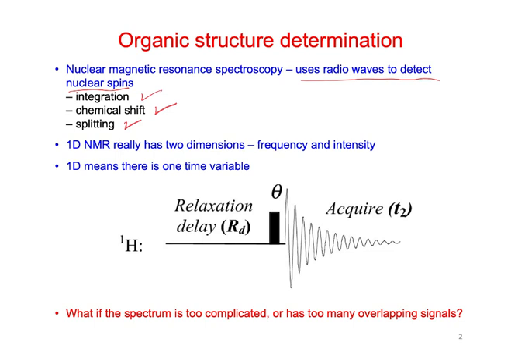So why do we need more than that? Essentially, if our spectrum gets too complicated, and we have too many overlapping peaks, we can't see what the couplings are, then we run into problems. This is where two-dimensional NMR becomes more useful, because if we take a one-dimensional spectrum that's overlapping and split it into two dimensions, we can sometimes resolve the peaks.